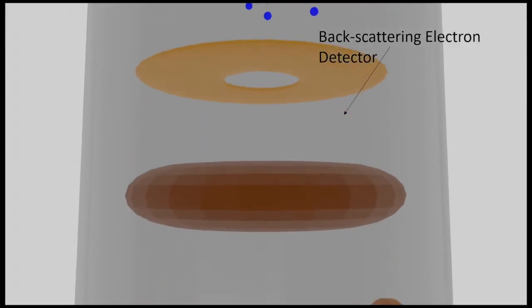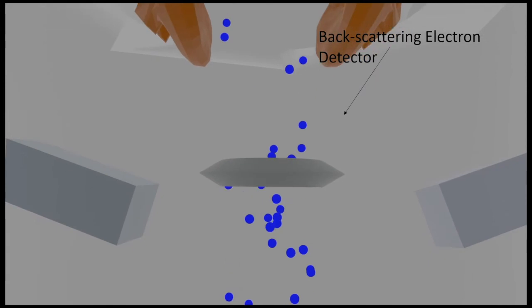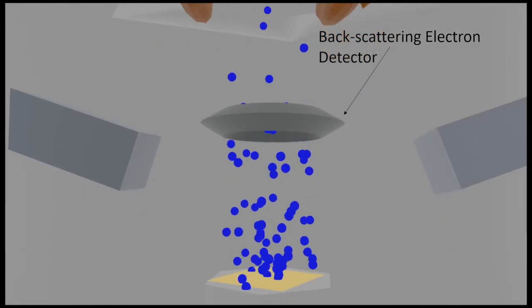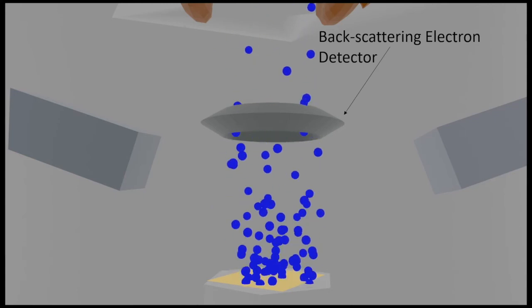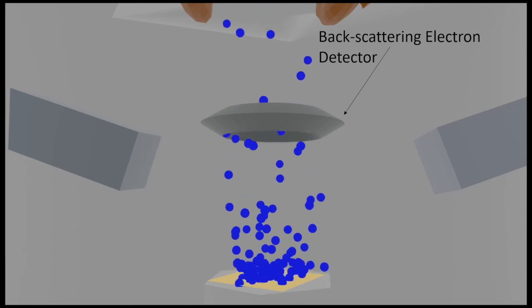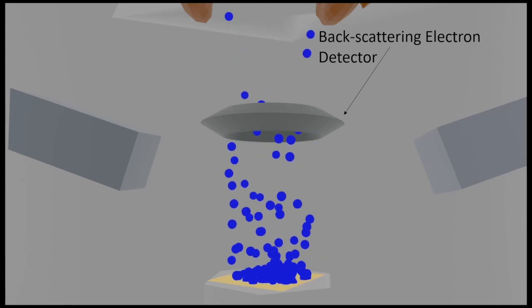The second detector is the backscattering electron detector. It is for the electrons that came from the electron gun and bounced straight back up after interacting with the sample. Once the electrons hit the detector, it will create a signal to help produce an image. Both the secondary and the backscattering electrons help produce a surface image.